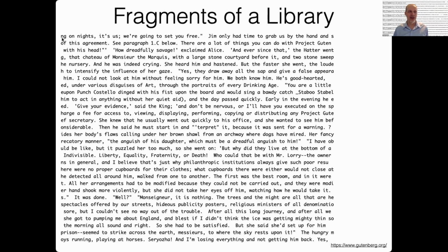So one way you can think about doing this is you would take this N here, that's the first character of the first fragment, and you would search it against the database. So basically you look through each letter of the database, and if the first letter of the database is an N, then you would go to the next letter of the fragment, which is a G, and say, okay, is the next letter in the database a G? And if it is, you keep going. Next there's a space in the fragment, so is the next letter in the database a space? And let's say it's not. So then you say, okay, it's not matching the first 3 letters of the database.